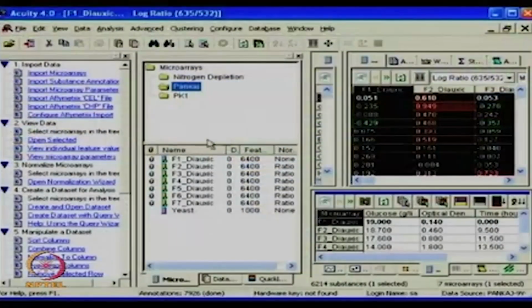So as we described, we see first the import data tab. Basically this allows one to take the data from the microarray database and store it in the form of a GPR file and allow that to be understood by the Acuity software. We also have the opportunity of text file import where you will define what is available for what.